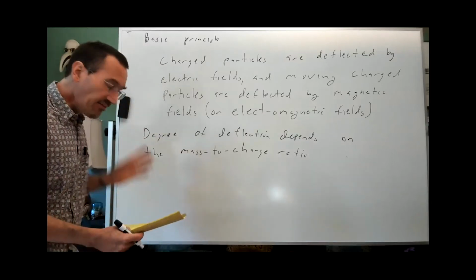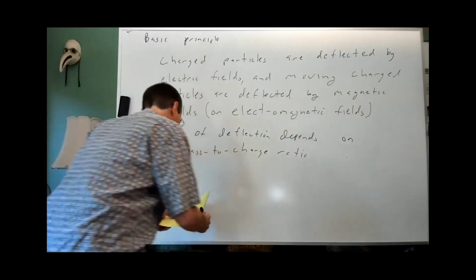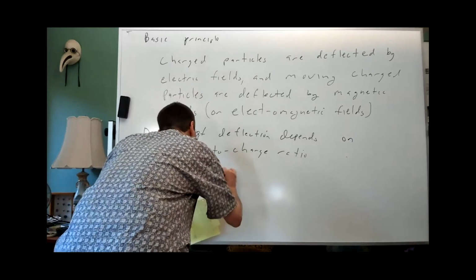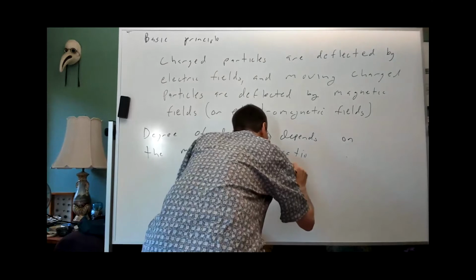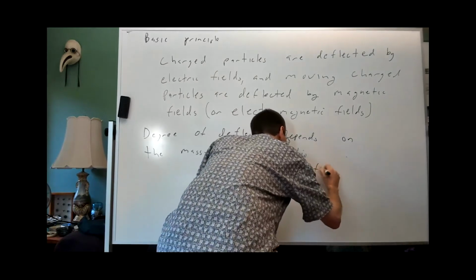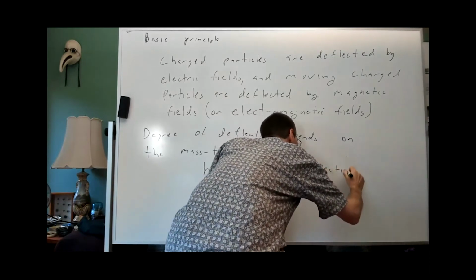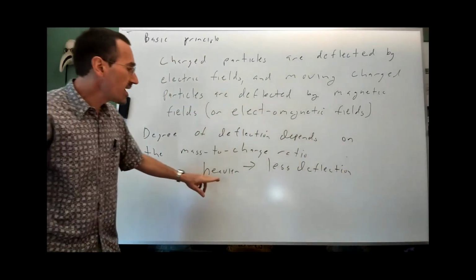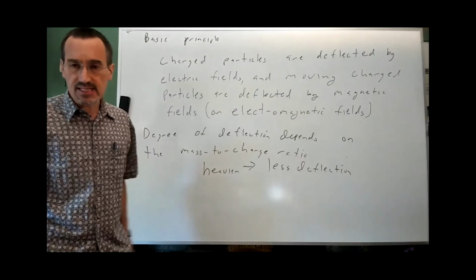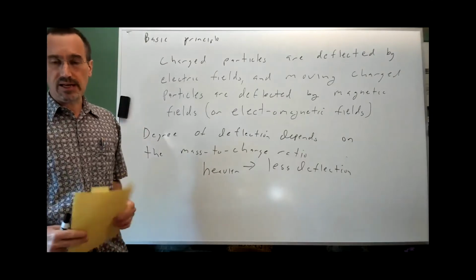Furthermore, the heavier the particle, the less deflection. And to a certain extent, that means that your technique becomes less sensitive for very high molecular weight.